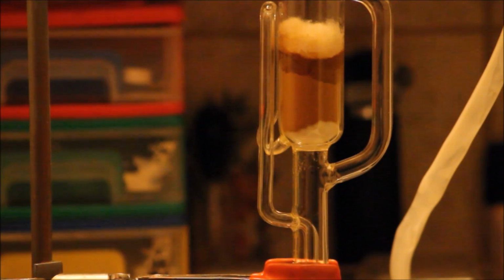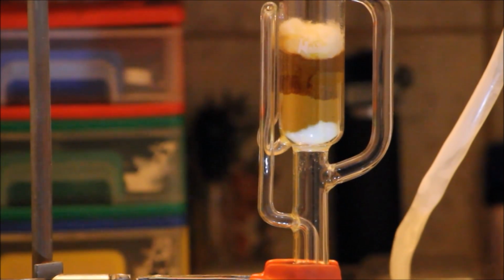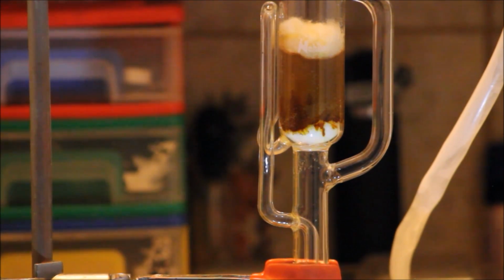Here you can see how the Soxhlet apparatus is filled as the reflux proceeds. Now let's turn on the UV light. You can clearly see the nice green fluorescence of the curcumin.